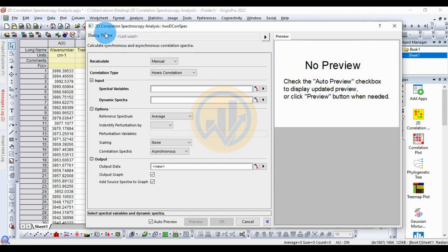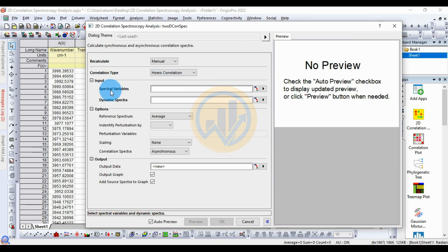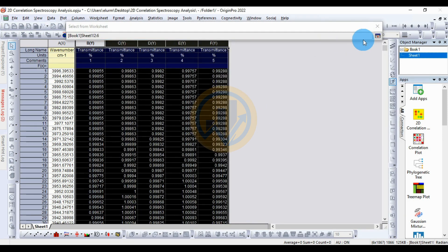Click the app to open a new tab for the 2D correlation spectroscopic analysis. The cell for auto preview is available. The recalculation method is set to manual. For the correlation type, there are two types: heterocorrelation and homocorrelation. We select homocorrelation. The spectral variable is set to wavenumber. For the dynamic spectra, all five samples are selected.